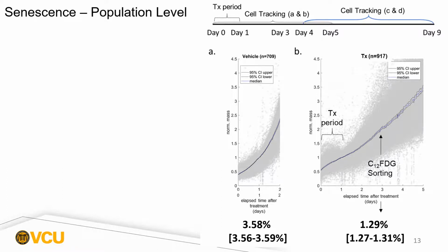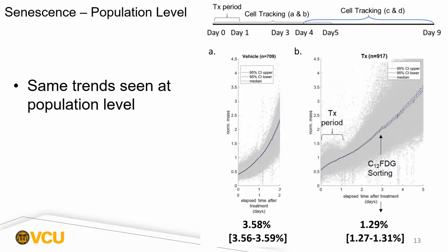The treated cells showed the characteristics like you saw on the last slide, where they grew at about 1.29%, most of them only growing in size and not in number. But there are rare exceptions that began dividing as well. To explore these rare exceptions, we performed flow cytometry for the beta-galactosidase metabolite C12FDG.